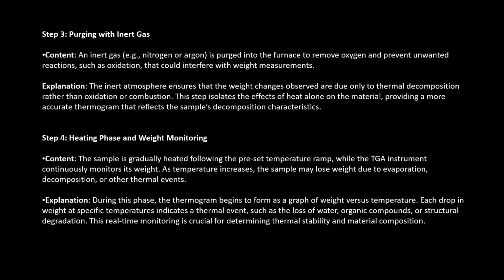As the temperature rises, the sample may experience weight loss due to processes like evaporation, decomposition, or other thermal transformation. A thermogram is generated showing weight changes as a function of temperature. Weight loss at specific temperature points signals distinct thermal events such as the release of water, organic compound, or structural breakdown. This real-time tracking is essential for analyzing thermal stability and material composition.